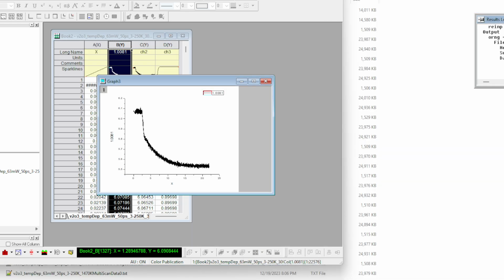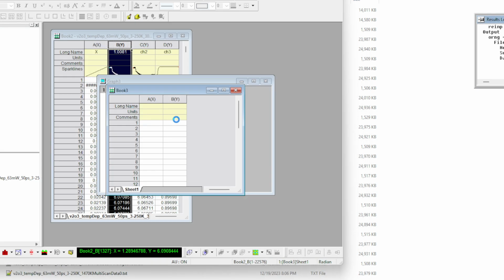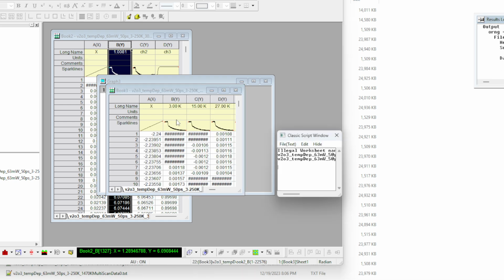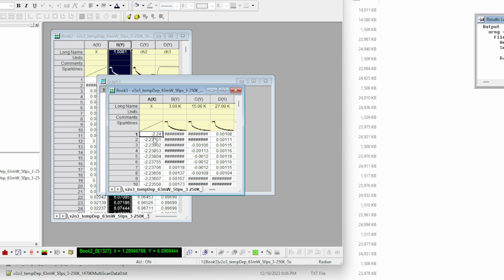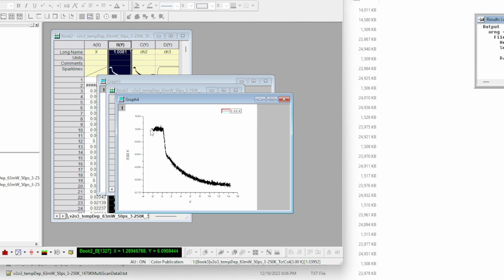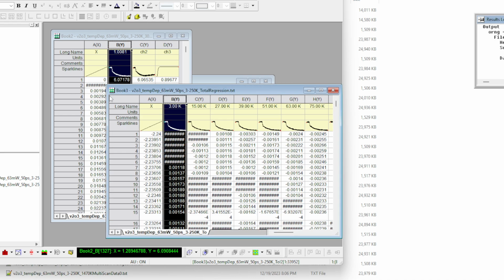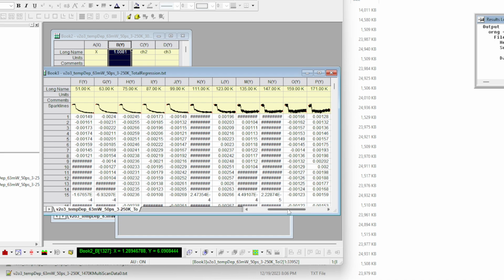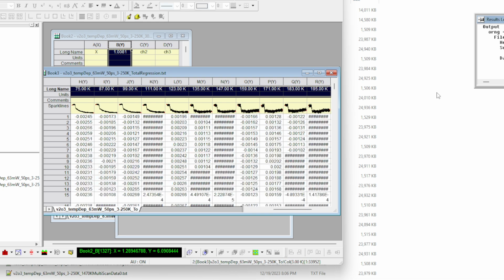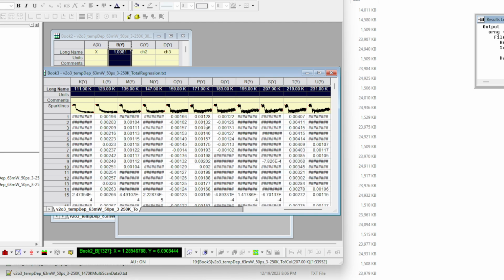And here I can open the Origin file. As you can see, this is minus 2.24 as shifted. And then you can see that it's delta R by R around 0. If needed, you can recalculate with the values that we got here. And this is what the program does. It resaves the temperature dependent set into one folder with all temperatures in one data table, and you can use it in other programs.